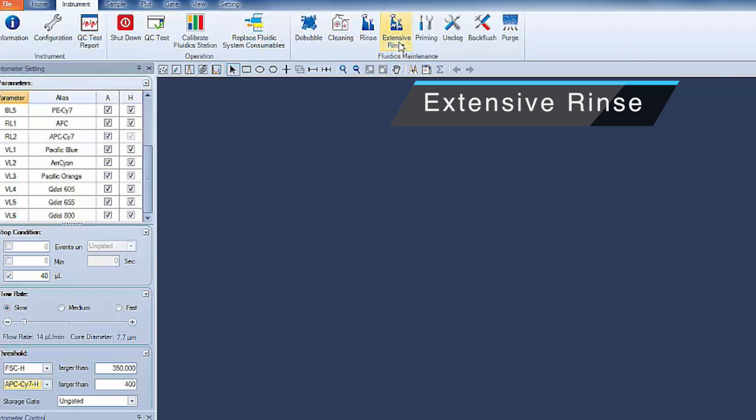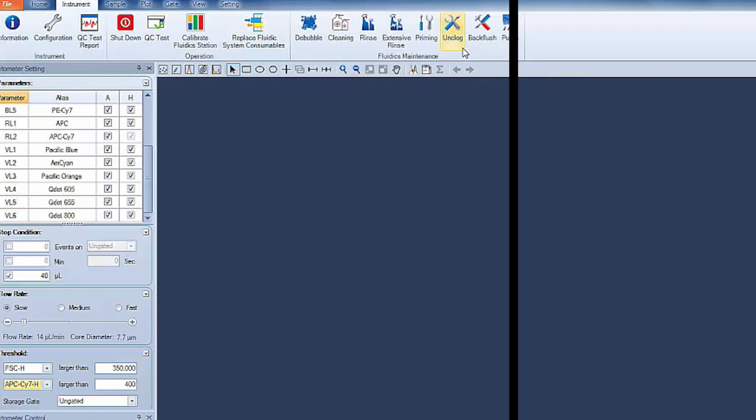Extensive rinse performs an extensive rinse on the fluidic system. Priming, after the instrument has not been in use for a period of time, clears the bubbles and fills the fluidic system with fresh sheath fluid. Unclog clears a blockage from the flow cell. Backflush clears a blockage from the sample injection probe.